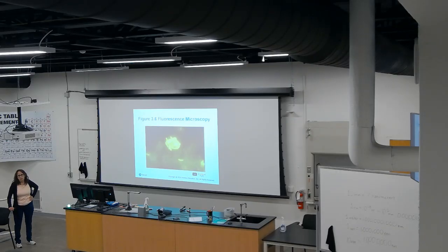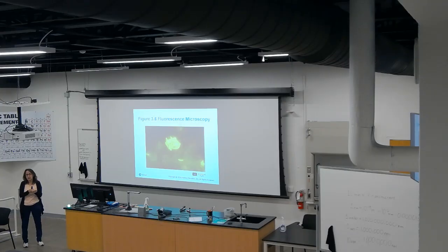One thing that in microbiology is important is that when you perform these fluorescence techniques in specimens that you believe are infectious, either for animals or for humans, you use antibodies that are coated with these fluorochromes. And these antibodies specifically bind against receptors of these specimens.